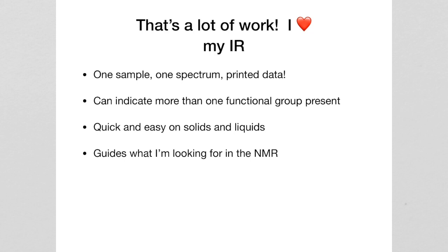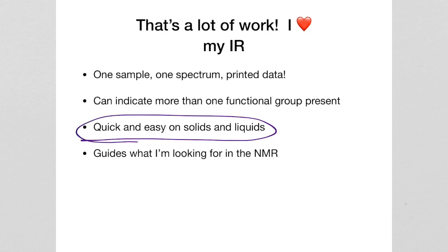Now, between the chemical tests and the solubility tests, again, qualitative analysis is how I learned to quit worrying and learn to love my spectroscopy. Because IR is quick and easy. Some of you don't make it quick and easy, but it is. You go in, you make one sample, you run one spectrum, and you get out a printed piece of data that you can take back to your room and analyze on your own time.